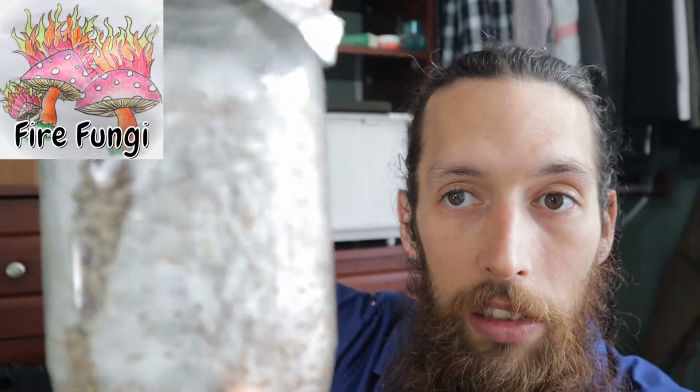So this is the first jar here. This is the brown beech. So I inoculated this on April 17th. It is April 27th today, and so it's been 10 days. And you can see the mycelium has grown down here. That's uncolonized, and then more colonization. It's kind of uncolonized right there.